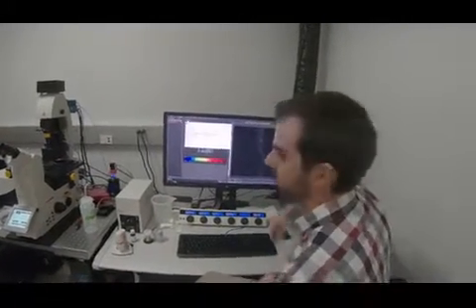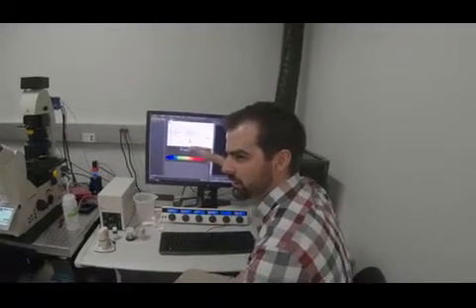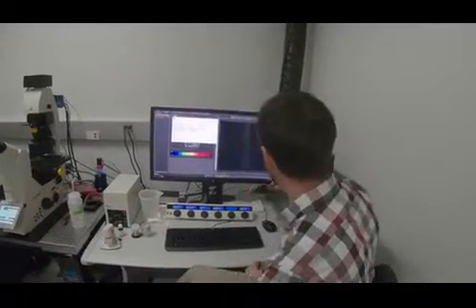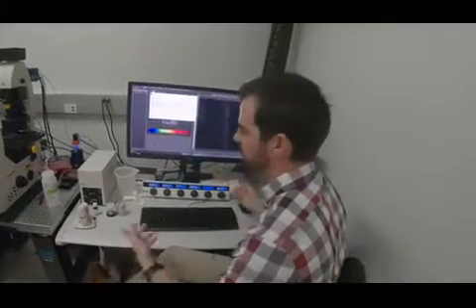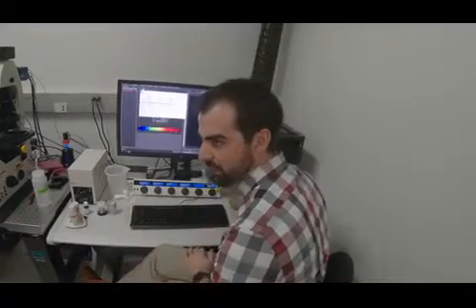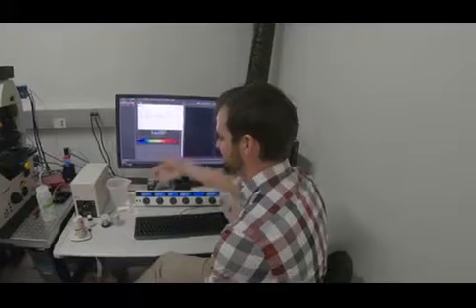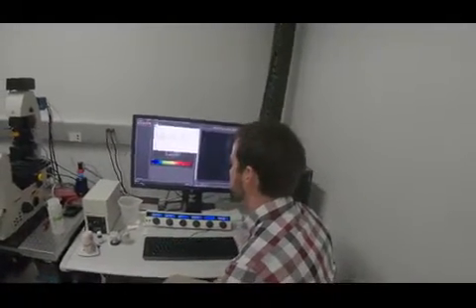If I just pull the power plug right now, everything that's open is written to this temp drive. It's not in RAM, which is volatile. Once the power's back on, turn the computer and LASX back on, and everything will still be here. If it was acquiring an image, it obviously won't acquire anymore because you don't have power. But the data you have acquired will be there, and then you can save it to the data drive, which is really nice.